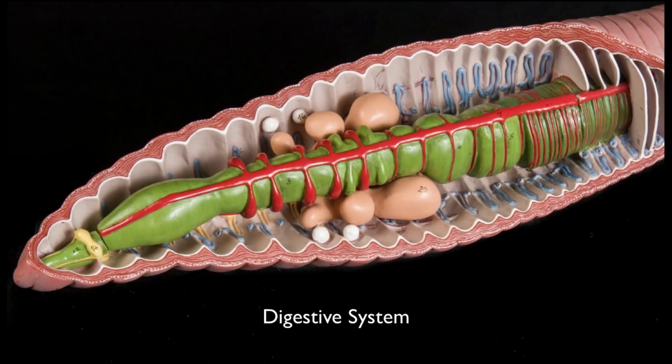The mouth is not visible in this view, so the first structure is the buccal cavity. This is simply a tube connecting the opening of the mouth with the next structure, the pharynx. The pharynx is a muscular tube that can expand to draw food into its interior space, much like you use your mouth to suck in a milkshake. Food is transported through the esophagus by means of muscular contractions to the crop. The crop serves as a temporary storage area until the food is allowed a little at a time into the gizzard.